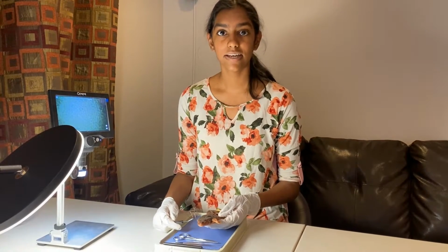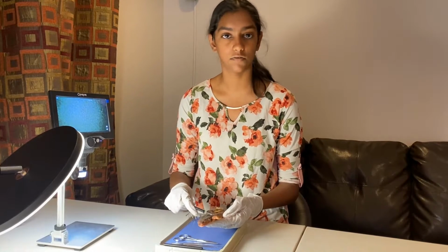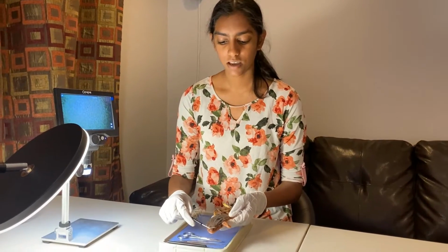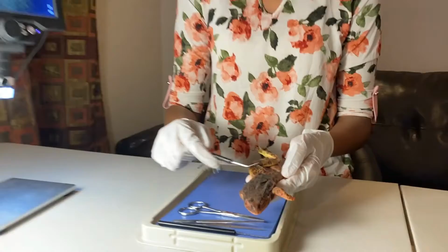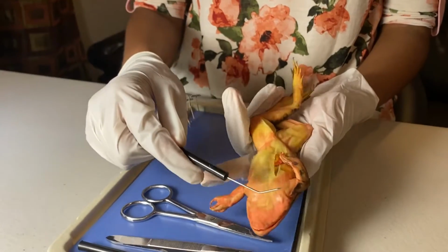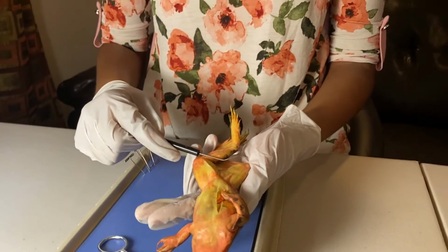Frogs have bilateral symmetry. This means that the right side of the frog and the left side of the frog are mirror images of each other. This is the dorsal side of the frog, or the top of the frog, and this is the ventral side of the frog, or the bottom of the frog.